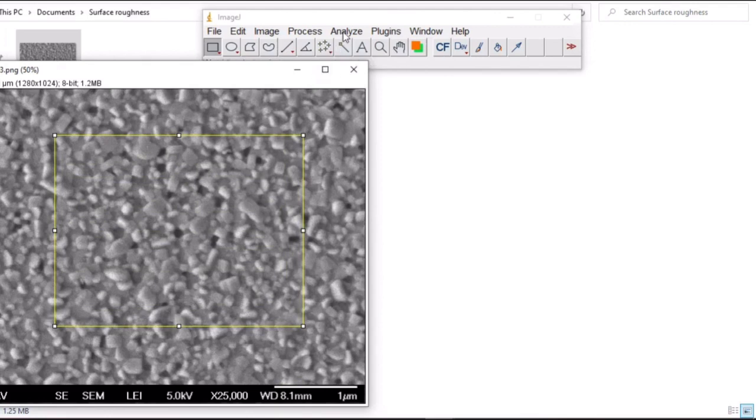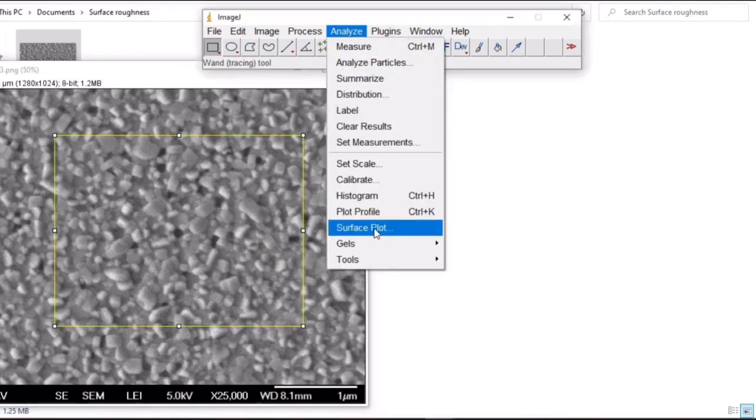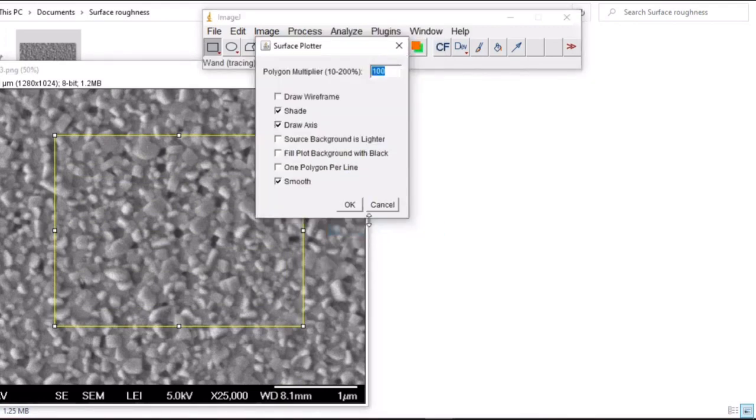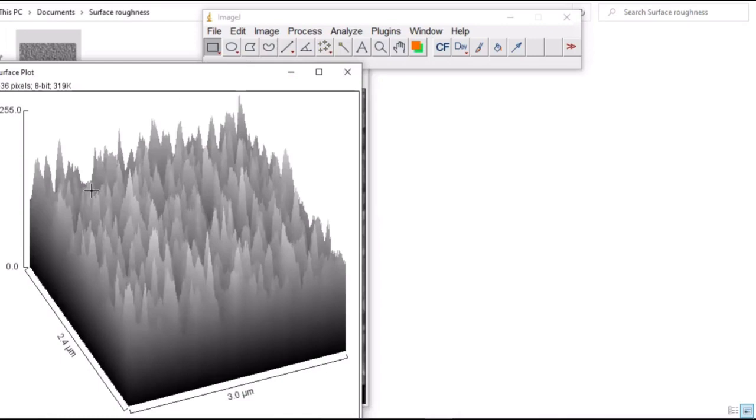Then go to analyze, then surface plots, OK. And it has generated your surface roughness.